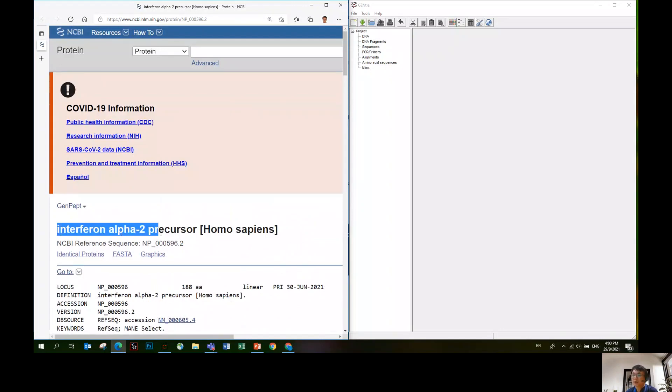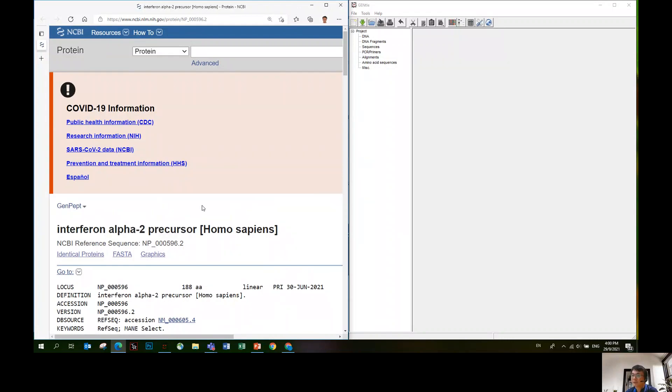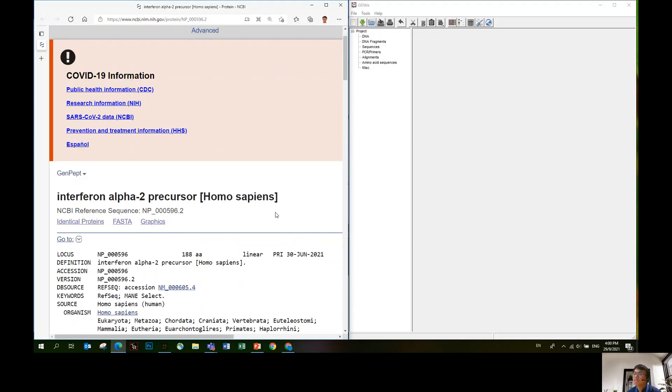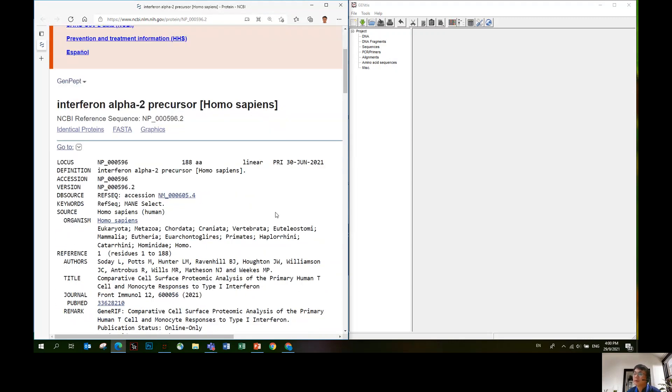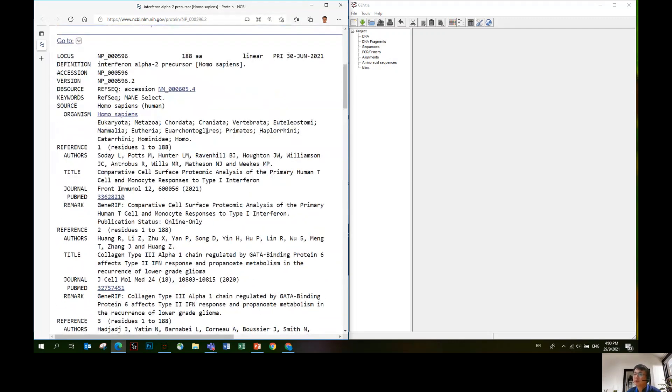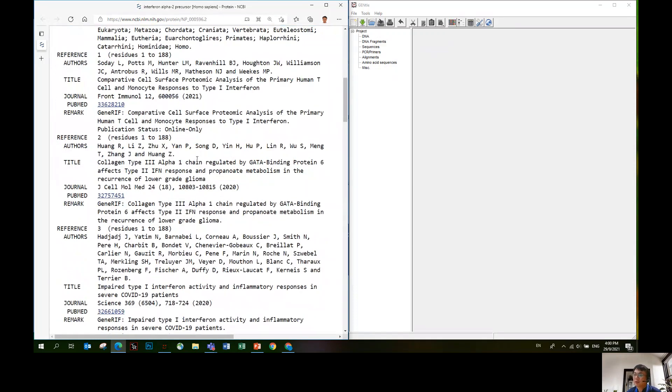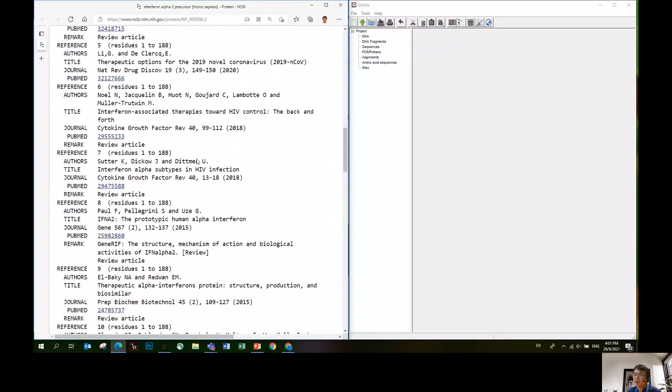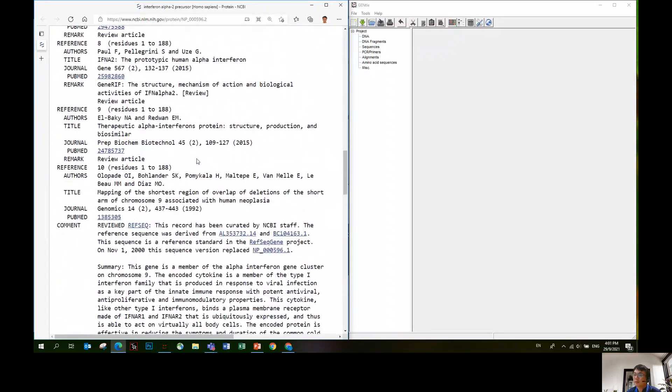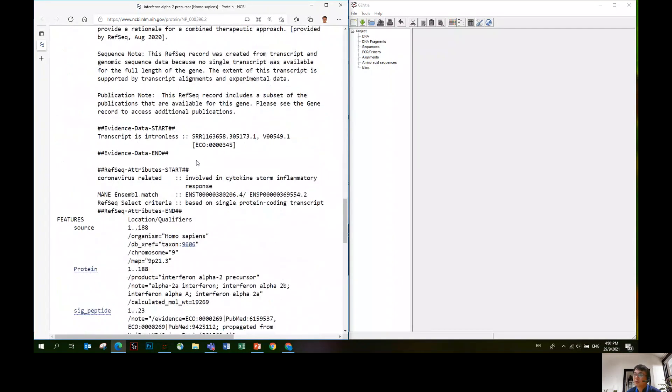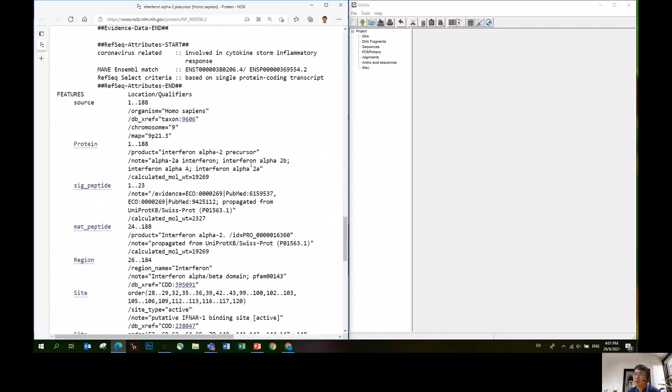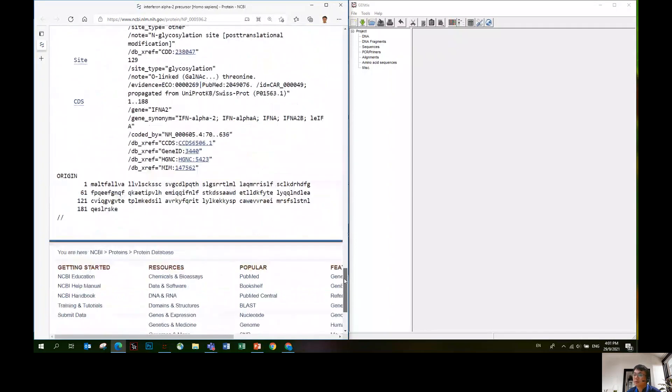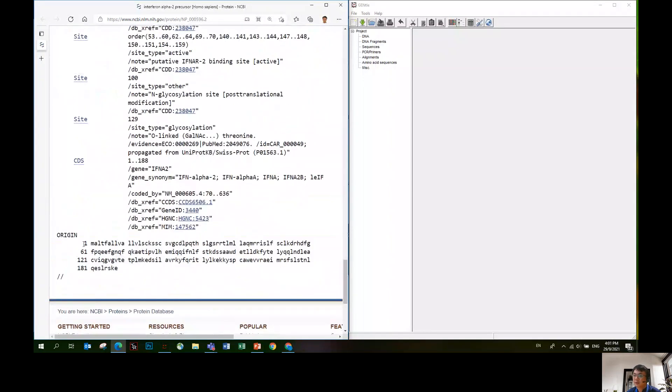The sample sequence used is interferon alpha-2 precursor. The link to this protein will be shared in the lecture slides or you can just type this ID. I'll bring you to the GenBank. Here it is. On the top there's a lot of information regarding the publication, but we don't need to pay attention to this. You scroll down all the way to the bottom, you will see the protein sequence.